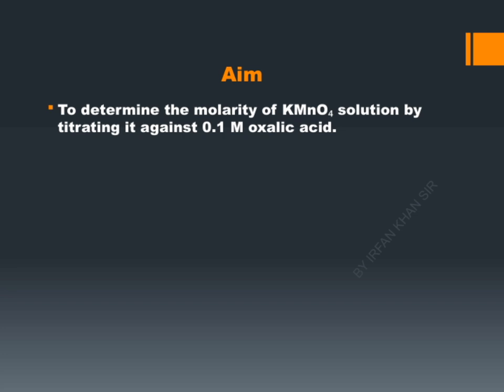The key concept is that oxalic acid acts as a reducing agent, while KMnO₄ is a strong oxidizing agent, and by carefully controlling the titration, we can calculate the molarity of the KMnO₄ based on how much oxalic acid it reacts with. This connection between the titrant and analyte is fundamental in analytical techniques, and it ties into the overall theme of accurately quantifying chemical solutions.